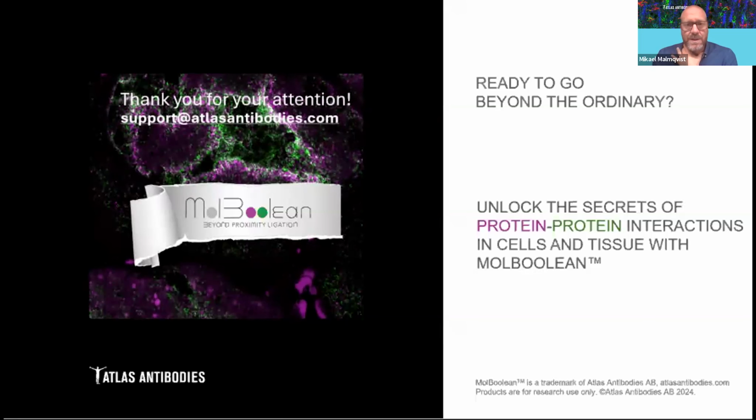Okay, good question here as well. I guess confocal microscopy is mandatory to decipher the signal of true interaction from overlap of two individual signals, i.e. false positive due to lack of resolution or signal stacking on said axis. Yes, it's of course always better to have confocal. We do a lot of imaging in epifluorescence, and then we use deconvolution to try to get the spots brighter. But it's advantageous to look at it in 3D also, to find these different objects if they are dual stained or single stained.